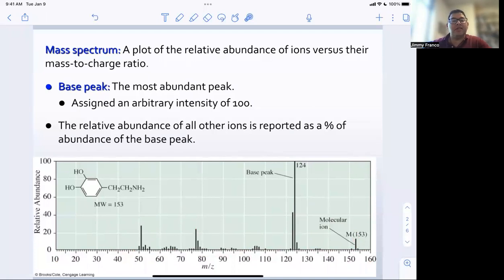In one way, this is actually really helpful because how the molecule breaks apart a lot of times tells us information about that molecule, like what functional group's in it, because things tend to break apart in a very predictable way. And again, we're just going to cover the mass spec very superficially, but it's actually a really, really useful technique. And a lot of biotech and pharmaceutical companies will send their new molecules through it so they can test to see exactly what's in the molecule or in their sample, and they can match up molecules.